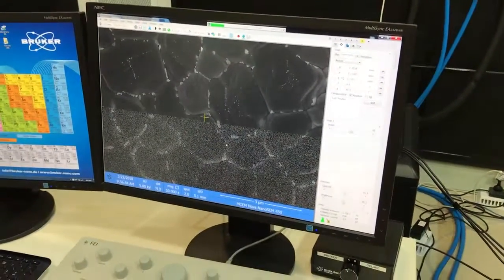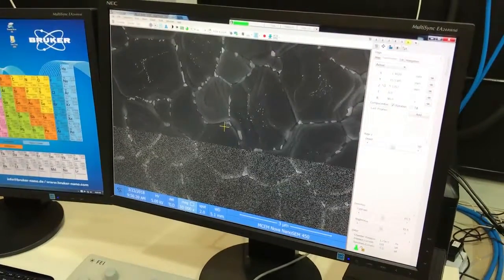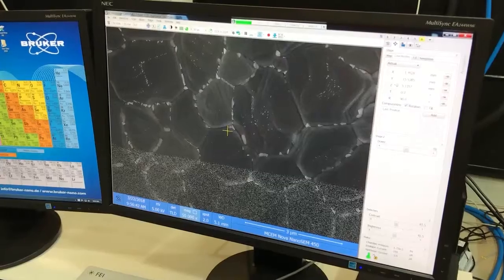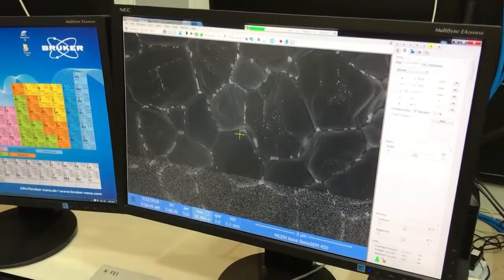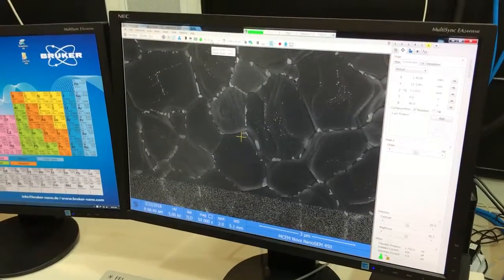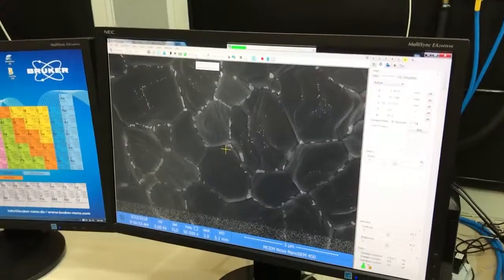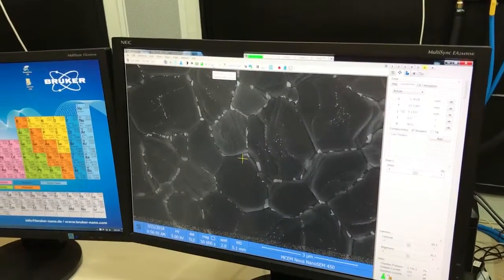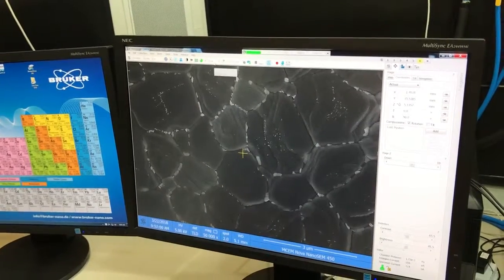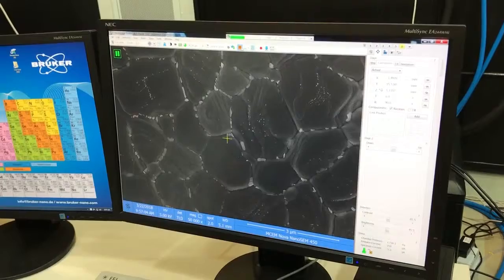Yeah, so just now we were taking a higher magnification image. Now we move to lower magnification to get an idea of how the film is going to look on a larger scale. This time I'm using 30 microseconds per pixel. It's entirely up to you which parameter. I should have just paused the acquire. Beautiful.